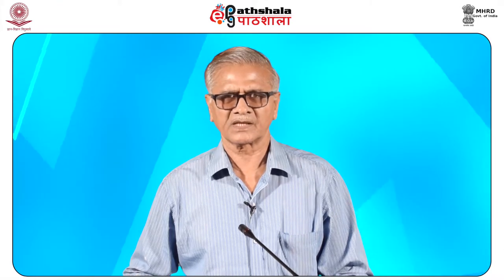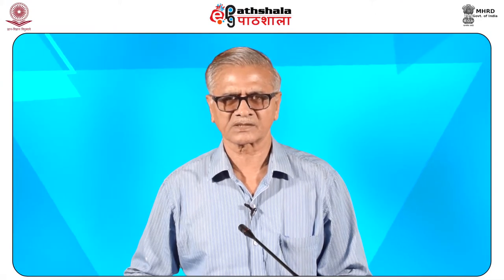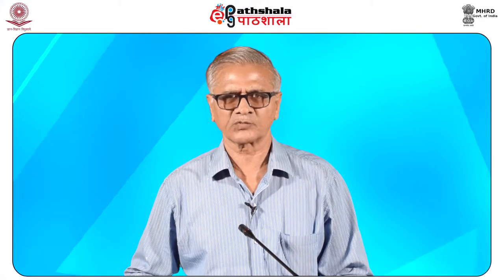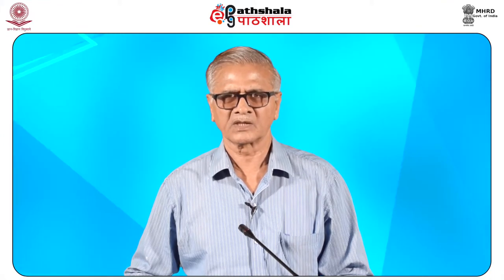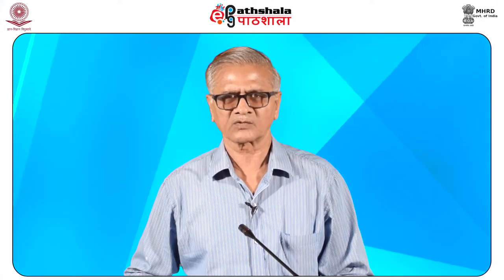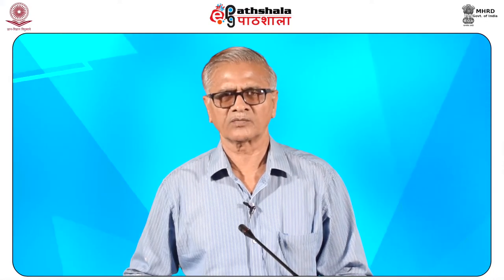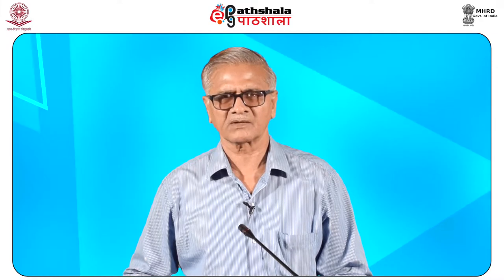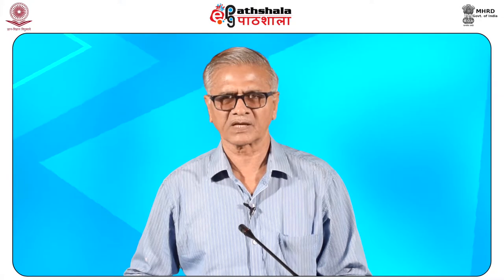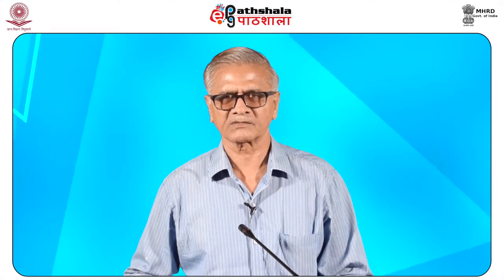be developed. In the late 1990s, new methods called second generation sequencing methods that were faster and cheaper began to be developed. The most popular, widely used second generation sequencing method was one called pyrosequencing. Today, a number of newer sequencing methods are available and others are in process of being developed. These are often called third generation or next generation sequencing method.